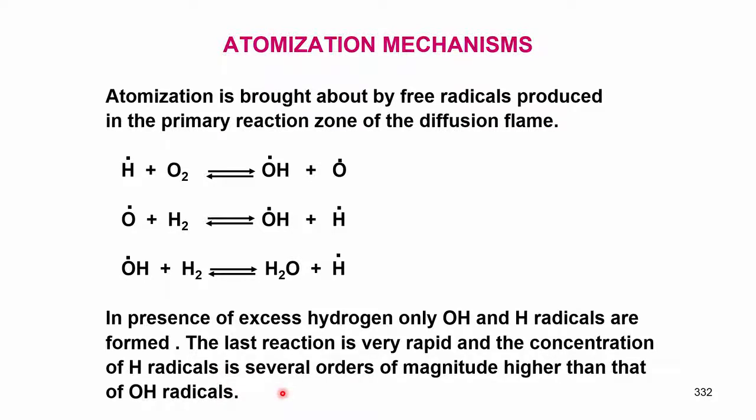We want the hydrogen radical concentration to be much more than the OH radicals or water. OH radicals or water do not make any difference to the formation of hydride atomization, because what we need is the hydrogen radical. This hydrogen radical is generated in the flame and will react with the analyte hydride.